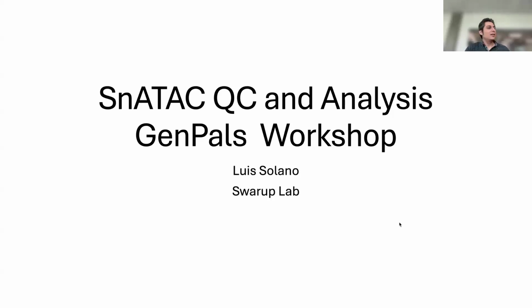Sounds good. All right, so for those of you that don't know me, I'm Luis Solano. I'm in the Swarup lab. Today we're going to be talking about single nuke ATAC, QC, and analysis. And I know it says workshop. Hope it's not too much of a bait and switch here.